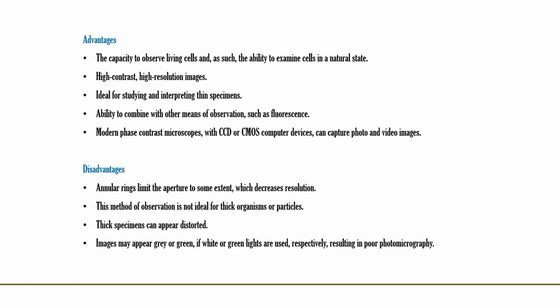Modern phase contrast microscopes with CCD or CMOS computer devices can capture photo and video images. In addition, advances to the phase contrast microscope, especially those that incorporate technology, enable a scientist to hone in on minute internal structures of a particle and can even detect a small number of protein molecules.